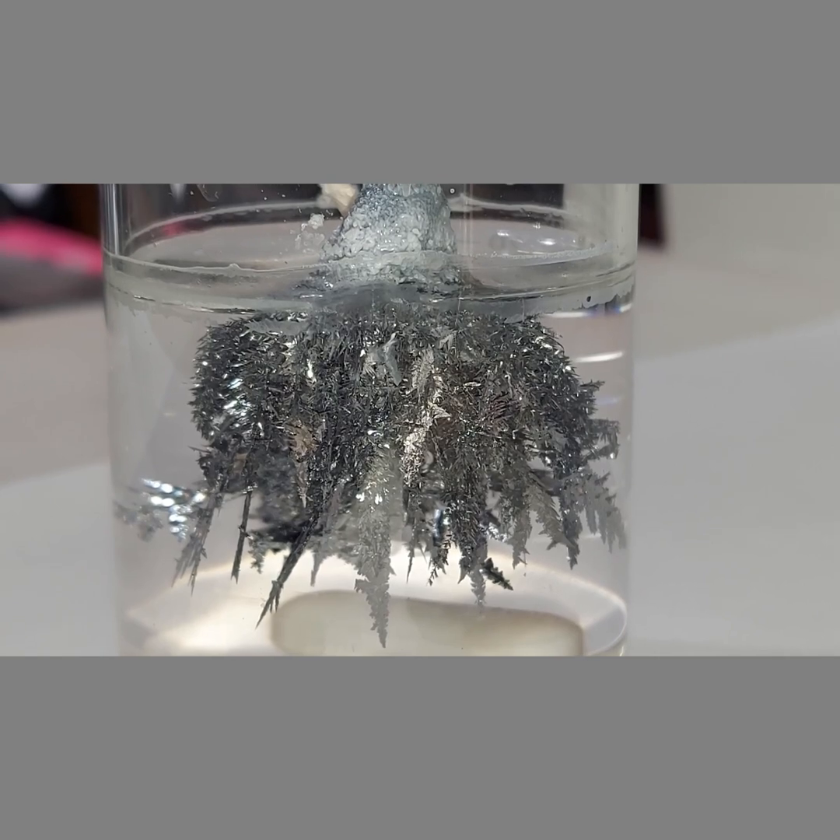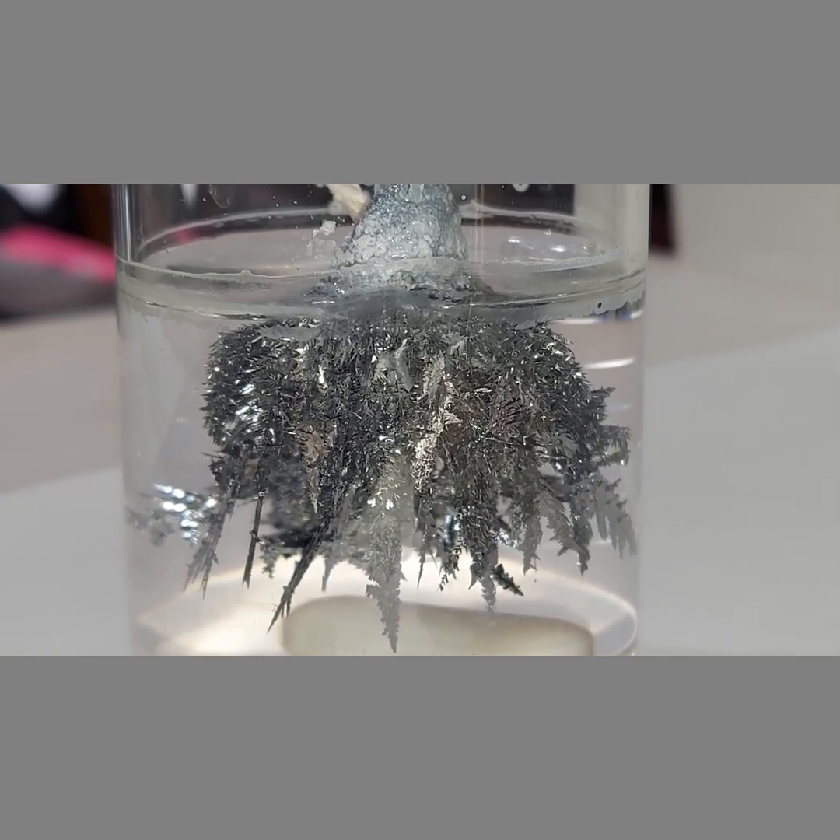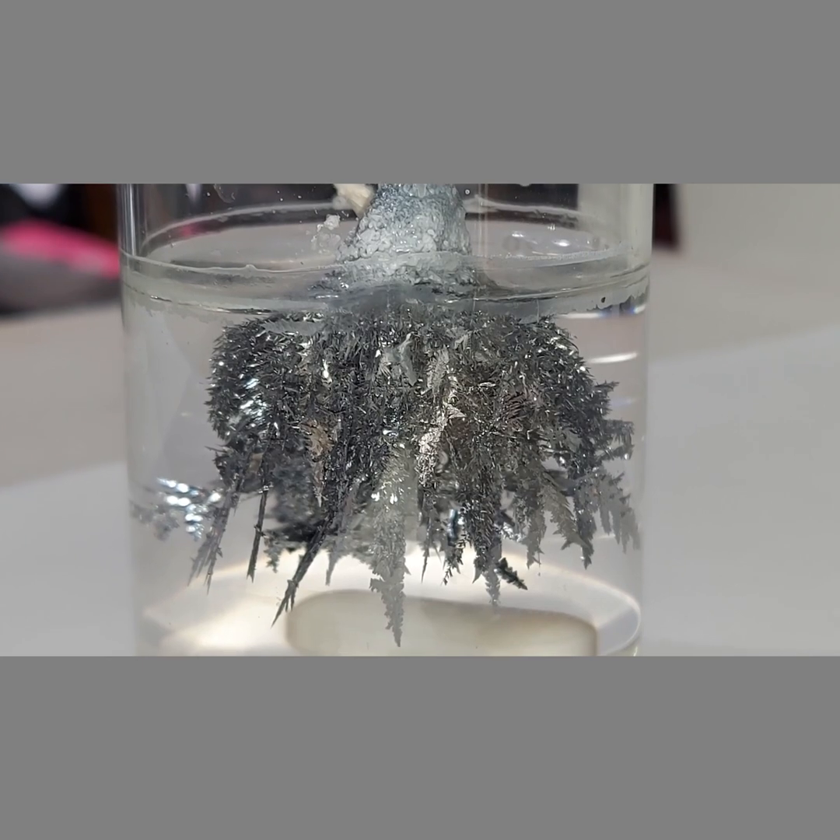24 hours later from the previous video — 44 hours total — and the lead crystals are growing really well.